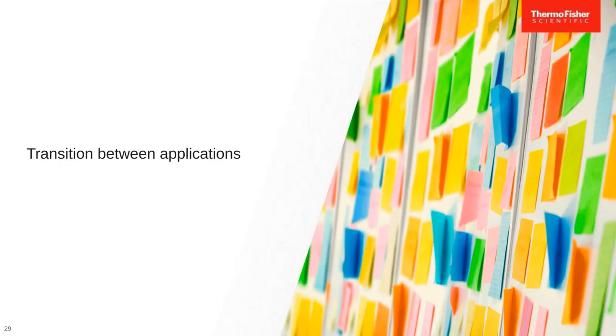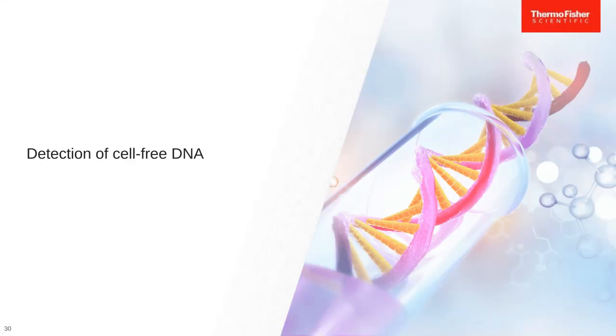So I just wanted to highlight one of those applications, which is oncology, and I wanted to focus on detection of cell-free DNA.